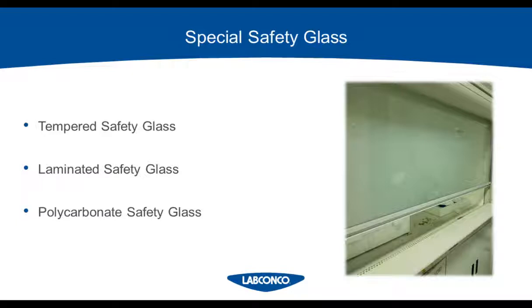With a specialty safety glass, this is where hydrofluoric acid comes into play. So most fume hoods will have a tempered glass, or it's also called toughened glass, or will have a laminated type of glass. So the main difference between tempered and laminated is tempered, when it shatters, breaks into small pieces, and laminated glass is sheet glass that's adhered by a layer that holds it together. So both of these have benefits and drawbacks. Tempered glass has greater resistance to force. Laminated glass does not shatter in most cases without a really astronomical amount of force.